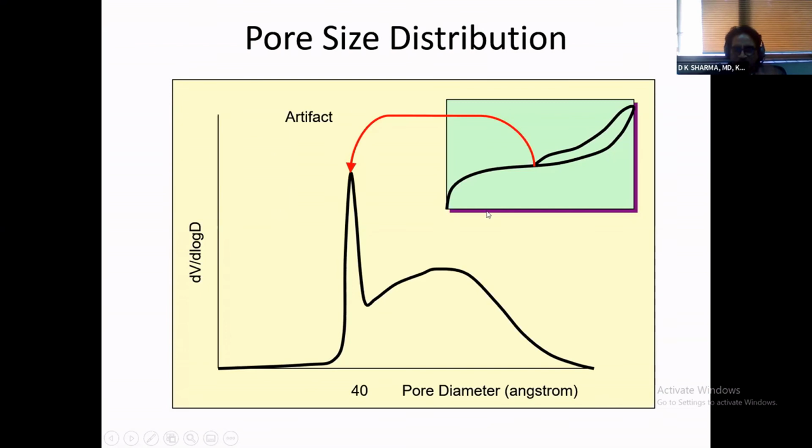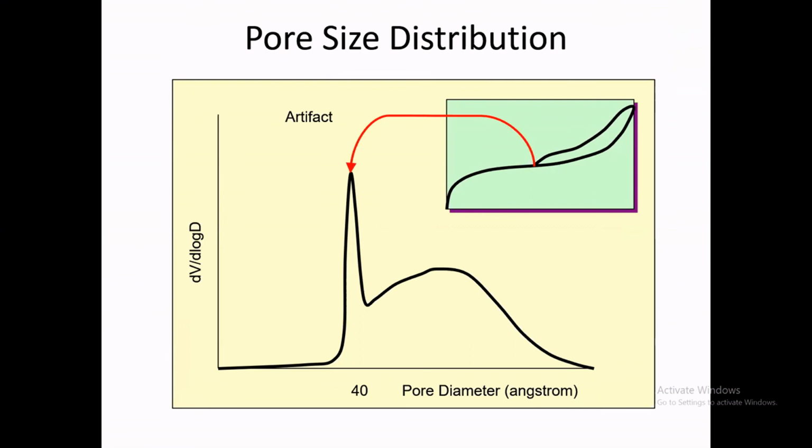The slide that I was looking for was to show that, generally speaking, it is very normal and desirable to use the desorption branch for pore size calculations. The desorption branch originates from a lower energy state.